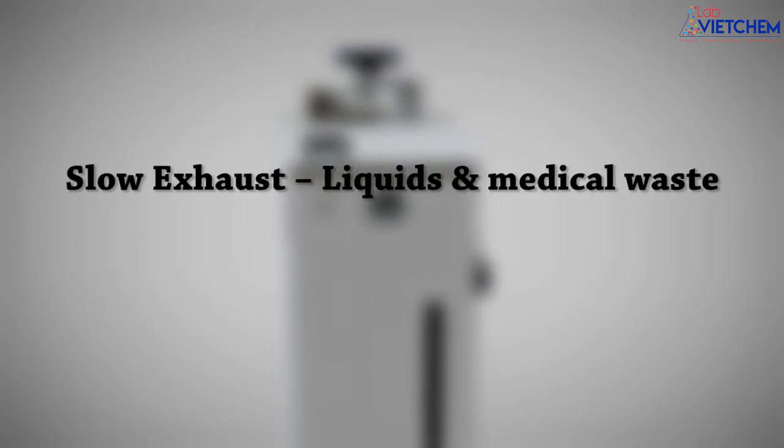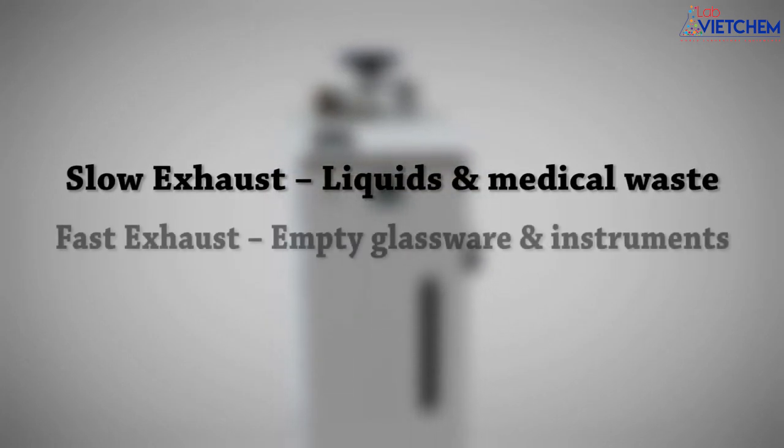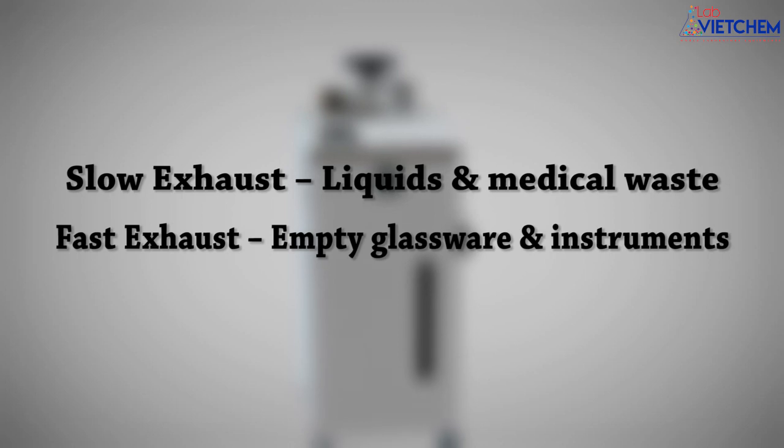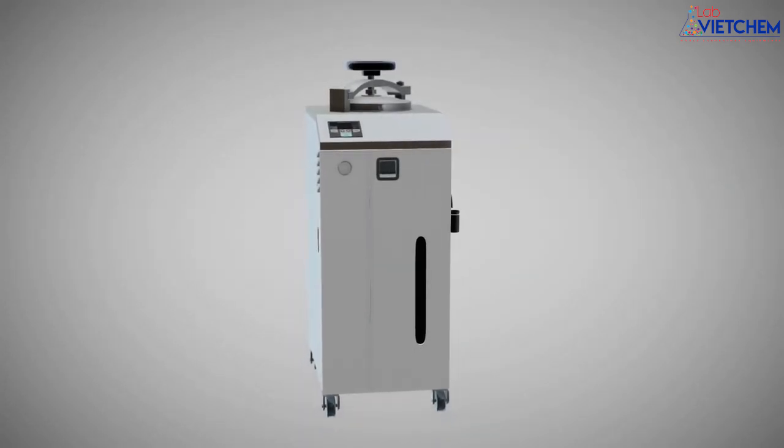Remember, slow exhaust is for liquids and medical waste. Fast exhaust is for empty glassware and instruments. Now you're ready to go to the lab and use an autoclave.